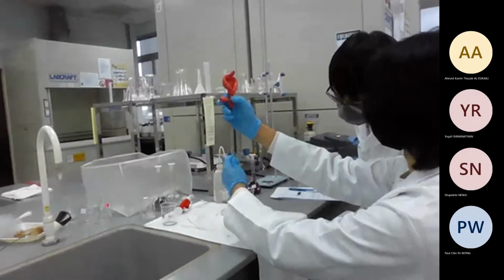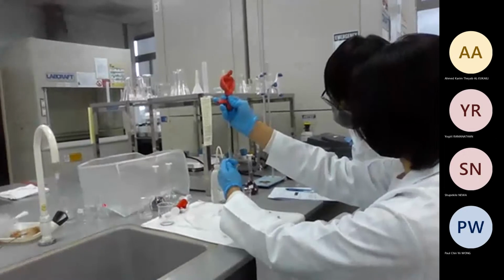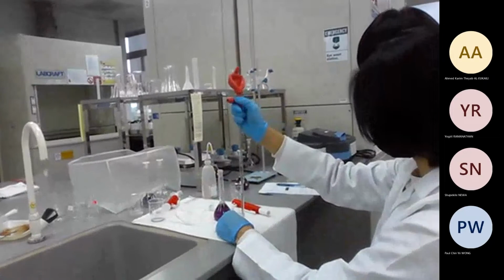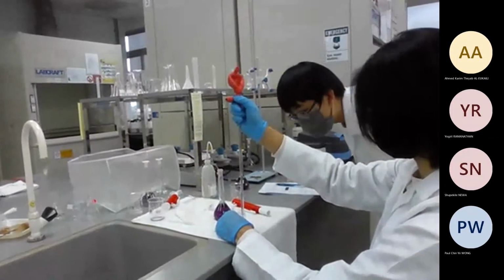See, if it goes inside this rubber pillar, then your sample is already corrupted. Or what is it called?